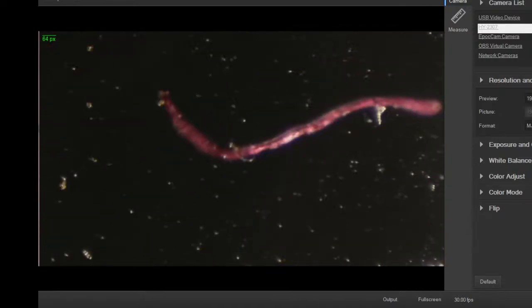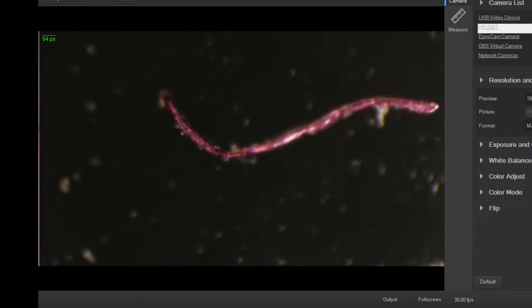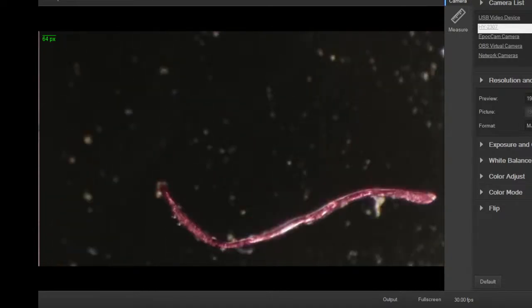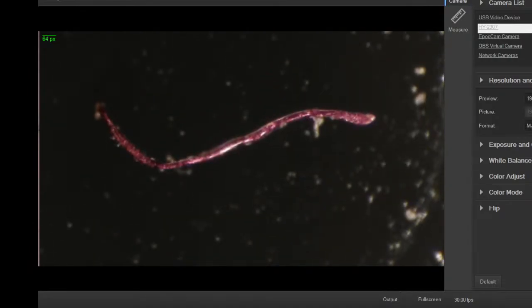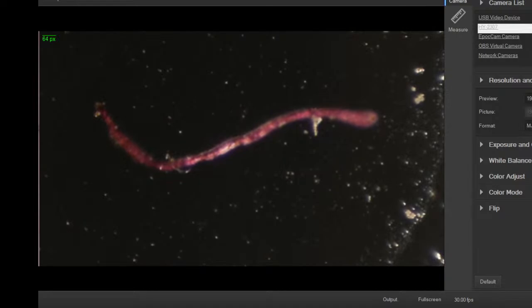There's clearly a man-made fiber there. Nice reddish color from someone's clothing, most likely. All you forensics fans out there, this is what they see a lot when they look for stuff at crime scenes and stuff. So if you're going to go out and do bad things, remember they can find this stuff pretty easily.